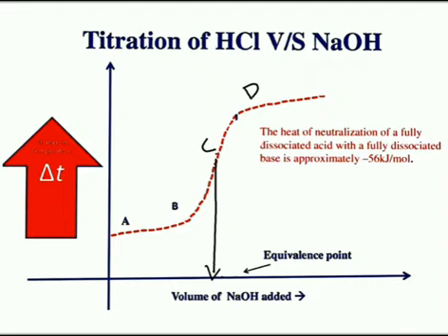The temperature is recorded for the different volumes by using the recorder, and the thermogram is plotted between the temperature and the volume of the titrant added.